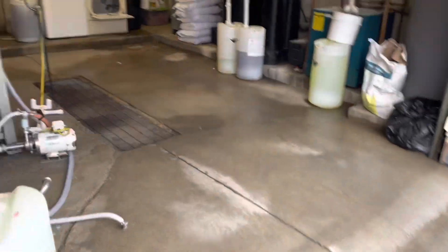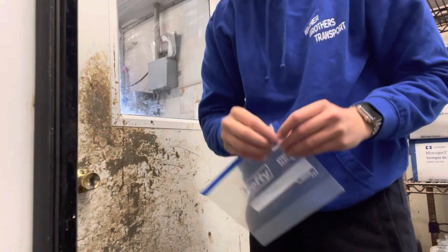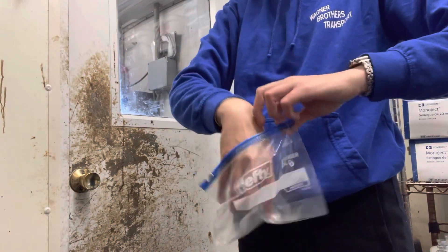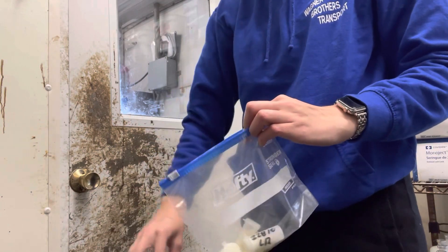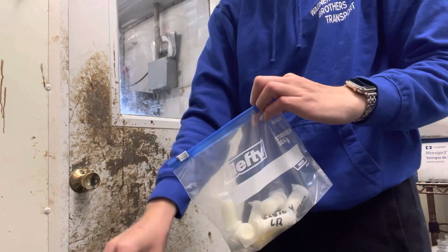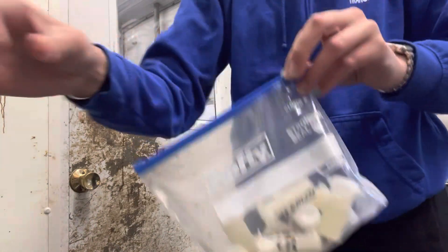Here's the hospital parlor. We're going to go in here and get the milk samples. There are a lot today. I have the milk samples, so now we're going to go up to my lab.